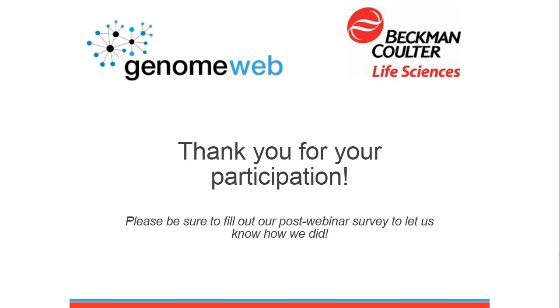Great, thank you, Vincent. Our next question is, have you noticed a concern at all for DNA or RNase contamination with TXTL reactions? Because it seems that could significantly affect CRISPR readouts. That's a very good point, because when you dispense with the Echo, the two plates face each other, and in particular the source solutions on the source plate are open, of course.